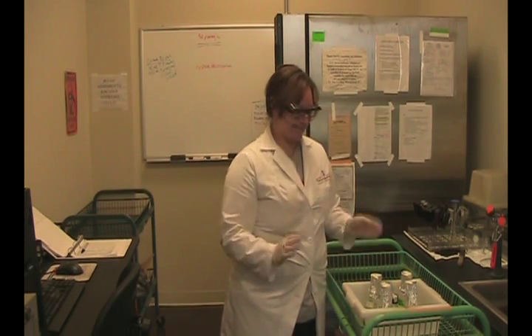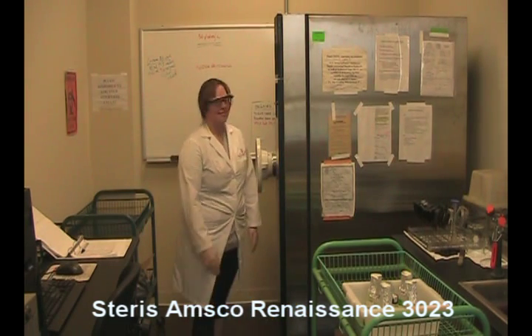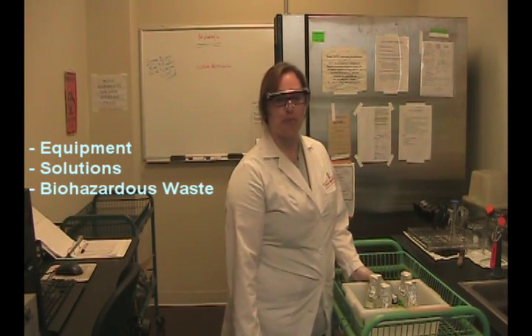The purpose of this video is to demonstrate the proper operation of the Steris Amsco Renaissance 3023 autoclave. Autoclaves are used to properly sterilize equipment, solutions, and biohazardous waste.